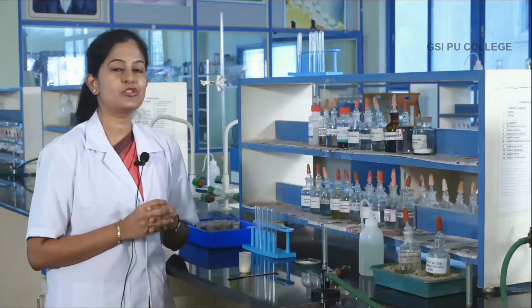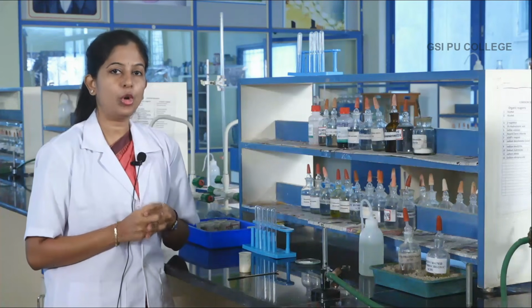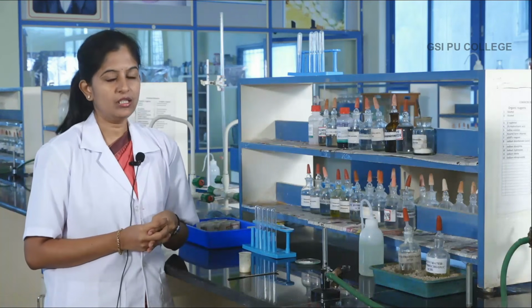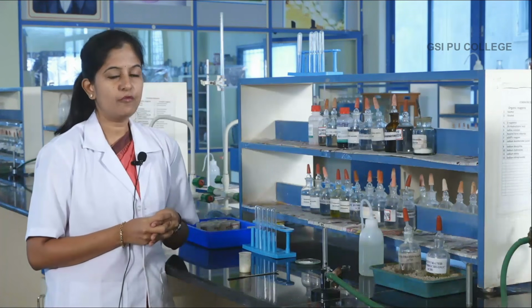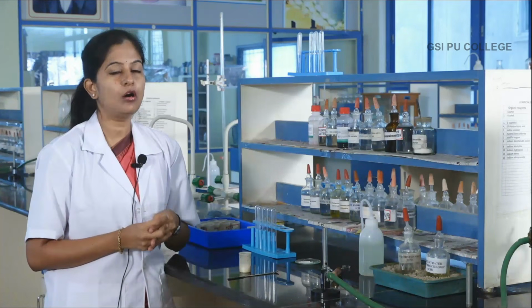Now let us move on to the solubility test of the given salt, whether it is soluble in the 2 reagents, one is water and the other is dilute HCl. First we are opting for water, in cold condition first followed by hot condition. If it is insoluble in cold water, you have to move on to hot condition.